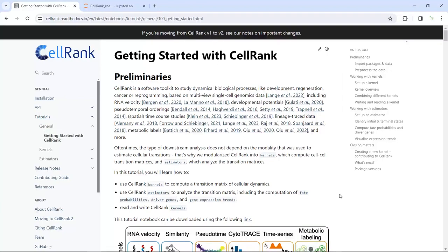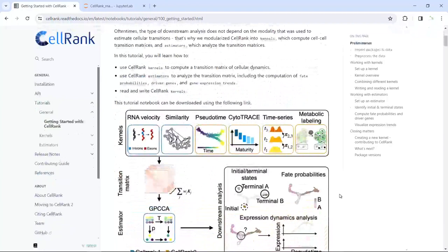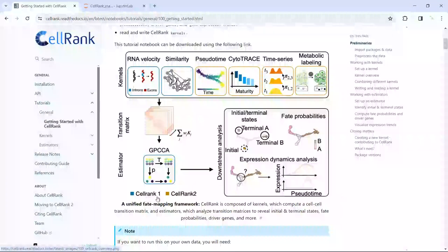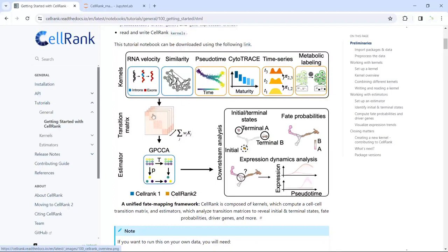CellRank updated from version 1 to version 2. In CellRank 1, we can use it to analyze RNA velocity and cell similarity. In version 2, we can analyze pseudotime, time series, and metabolic labeling.